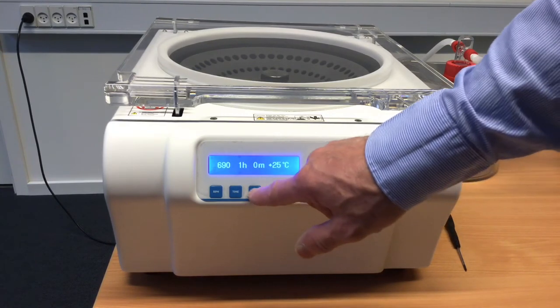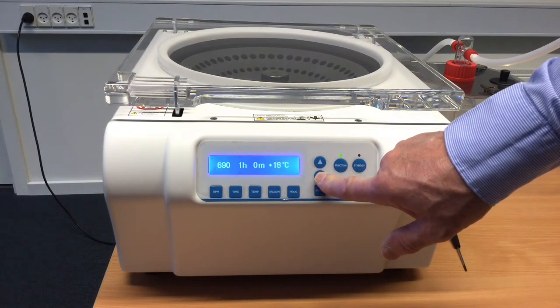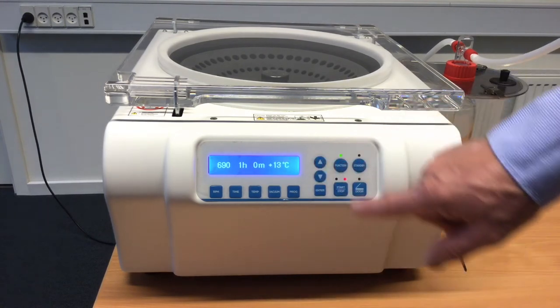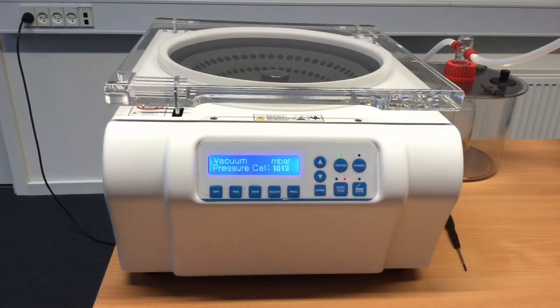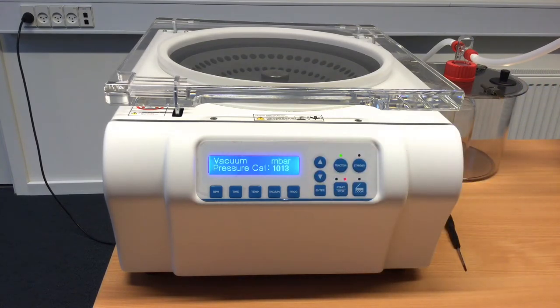For temperature, you can now change it — go up and down. You can see we can go down to plus 4°C or up to plus 80°C. Press enter. The vacuum is actually not controlled; we cannot control the pressure, but it will show you what the actual pressure is.